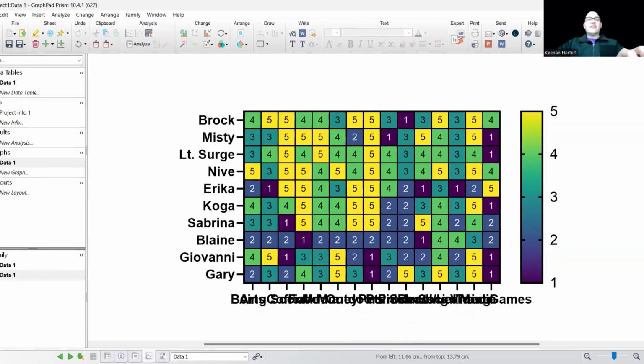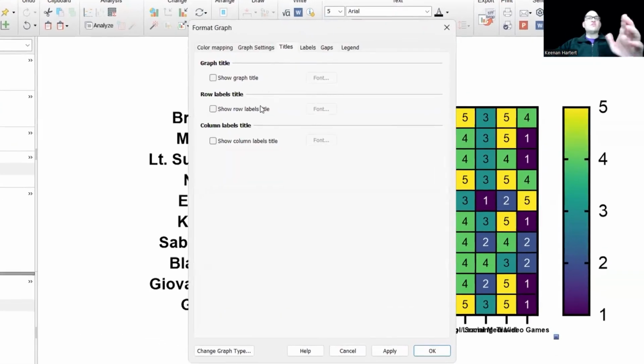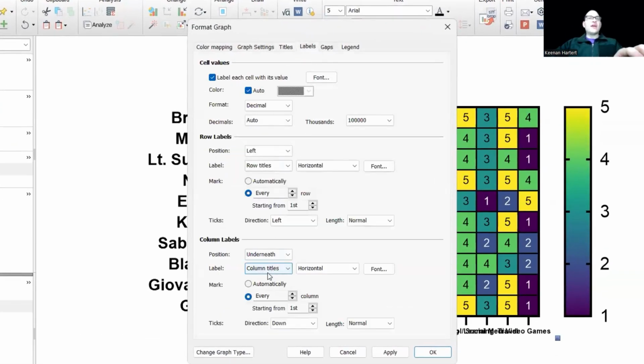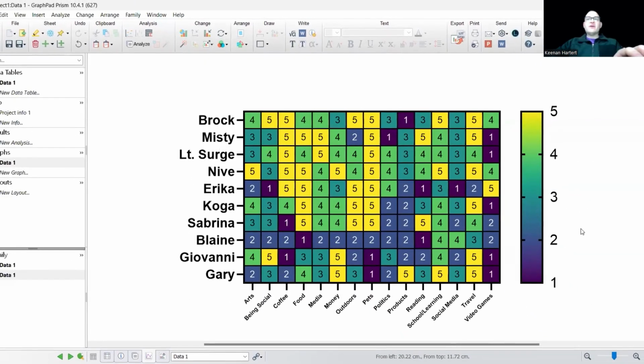Given that, as you can tell down here, I'm going to have to probably reduce this text size down here, and I know you can go down to 4 if I wanted. What I'll have to do right here is double click and say I just want this to be a little more angled in this case. So I'm just going to give that a little angled degree right here. So that looks good.